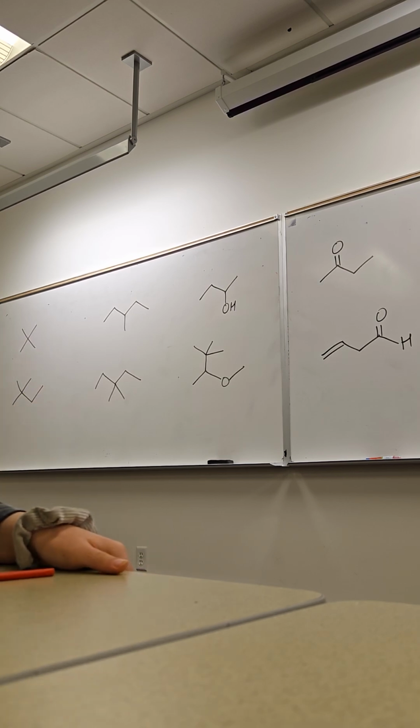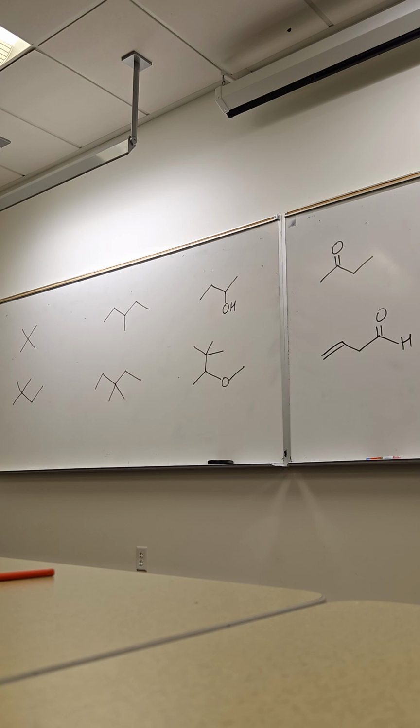The reason I think there's two is because this one has an H right here, right? There's an H. How could it have H? It's got 4 bonds. It can't have more than 4. No, I'm talking about this. Yeah, that's a C. Count all hydrogens. You're all thinking hydrogen. All hydrogens. Yes, all hydrogens. They'll have their own signal.